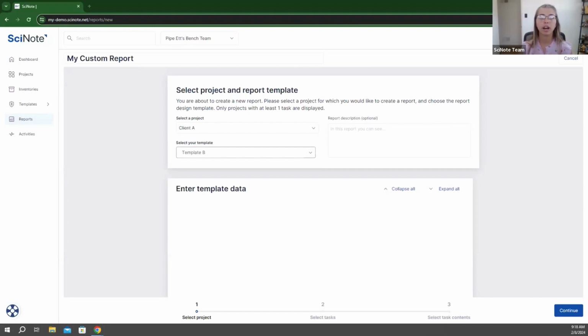If you aren't sure if something that you are currently doing with your report is something that we can do for you in our custom reports, ask us, because we'd be happy to help. And if we are unsure exactly if it is something we can specifically do, we'll always take that information and reach out to our technical team and get back to you. Because I know that there are a plethora or an endless types of ways that people are creating their reports, depending on where you're sending it to. So any questions on custom reports before I change the direction to talk about status flow?